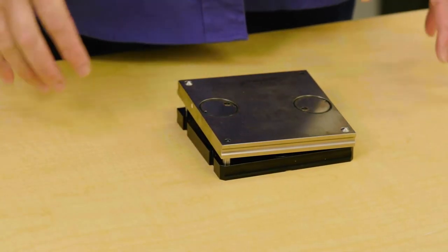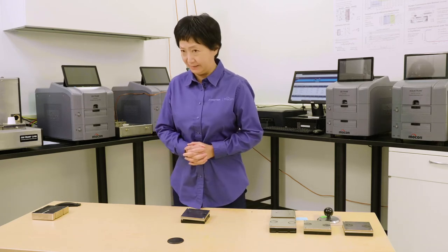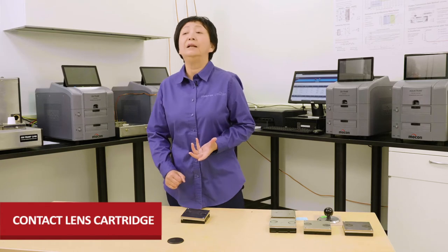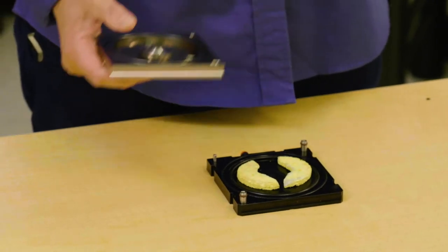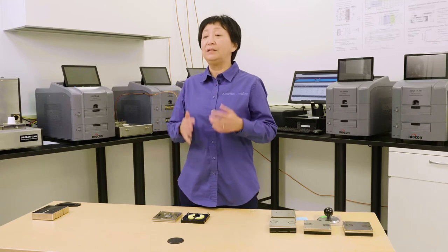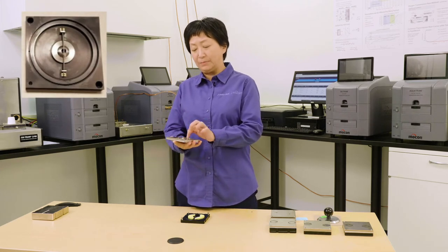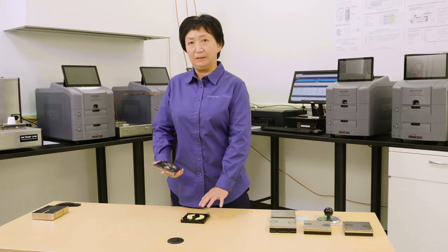For anyone wearing contact lenses, a higher oxygen transmission rate of the contact lenses means healthier eyes, so it's important to test OTR for contact lenses. We designed a specialty test cell for contact lenses, and when used together with the Oxtran 222H, it conforms to ISO 18369-4, which is designated for contact lens testing. It has a special well and a special landing piece for holding your contact lenses, and you can put a sponge there to control the high relative humidity needed for this testing.